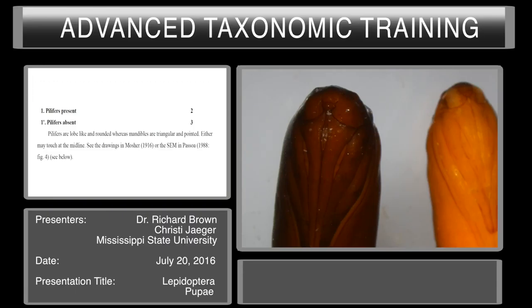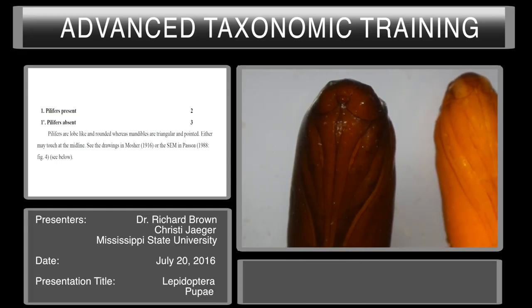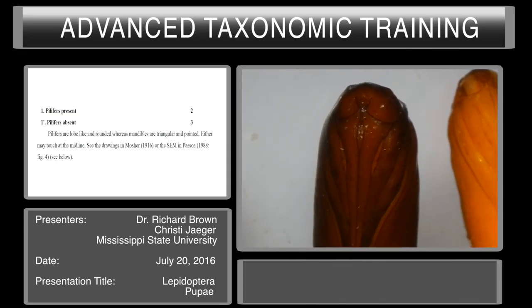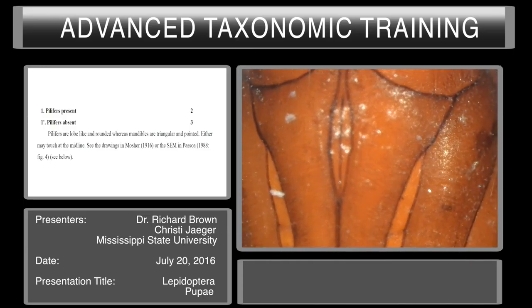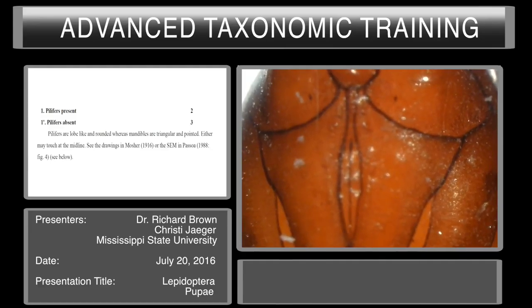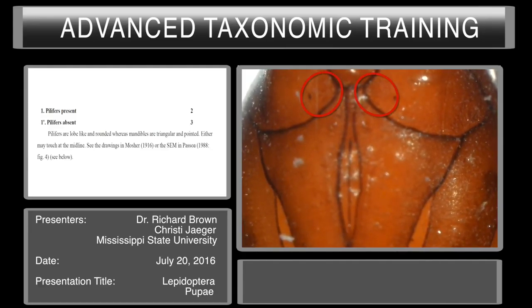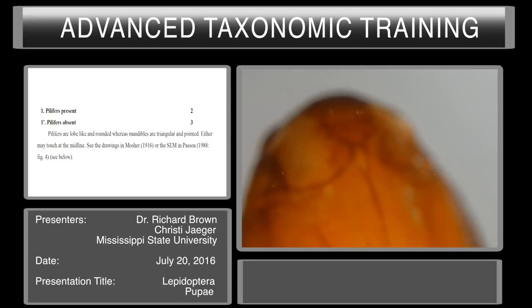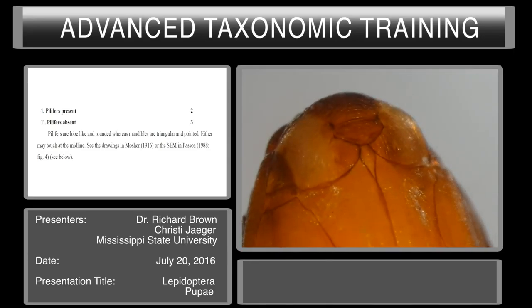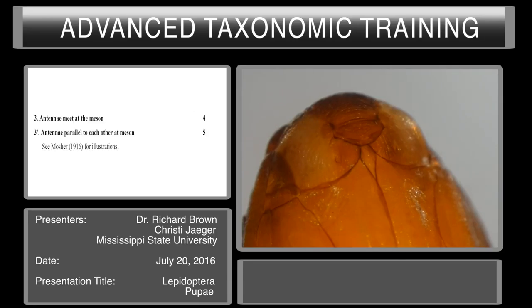The first couplet in our key is looking at the pilifers and whether or not they are present or absent. This is the pupae we're examining and the pilifers are absent in this species. Pilifers are a dark patch, as seen here, and in this cactus moth we can see them present, as they are present in the Pyraloidea. That's that darker patch right there. So we go to the next couplet — pilifers absent, couplet three.